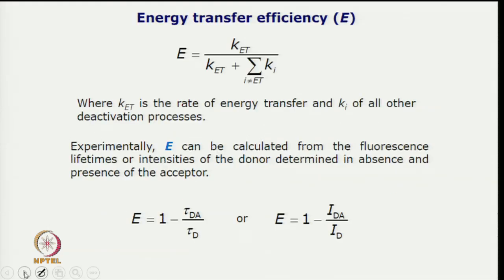Since there is energy transfer from donor to acceptor, we define a term called energy transfer efficiency, which tells how efficient this energy transfer is.